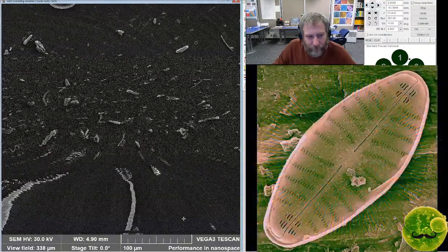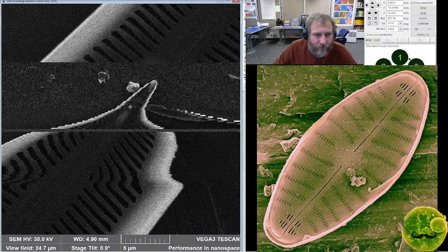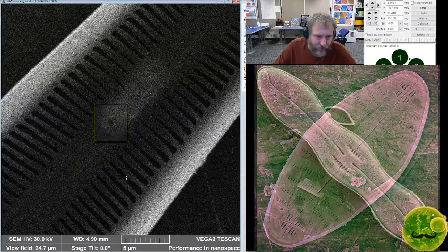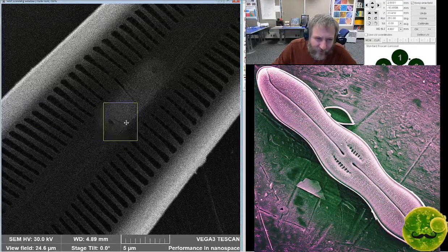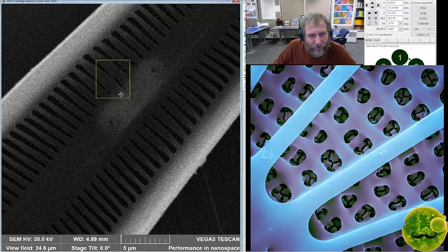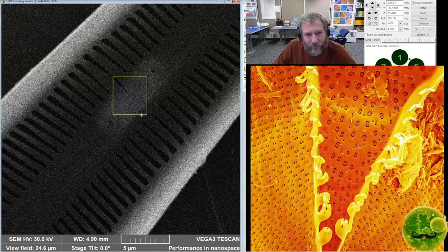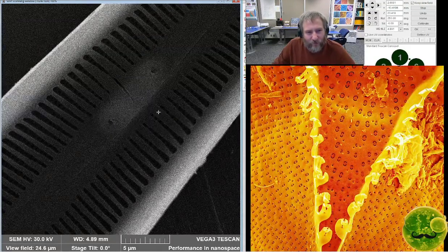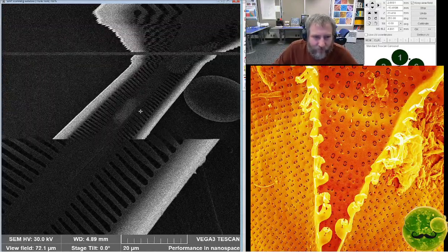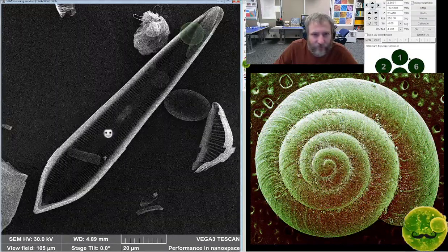This is an internal view of our unicorn, right here, and you'll see why I think that they're closely related. That's the end of the raphe. It does a sort of left hook with a curl, or right hook with a curl on this side. And then the stigma, or stigmoid, comes off of a central striae and is slot-shaped and runs down between them, but doesn't connect. So, to me, that belongs to the same thing that we've been looking at from these other Afrocymbella-like diatoms. Currently, that's a Gomphonema.